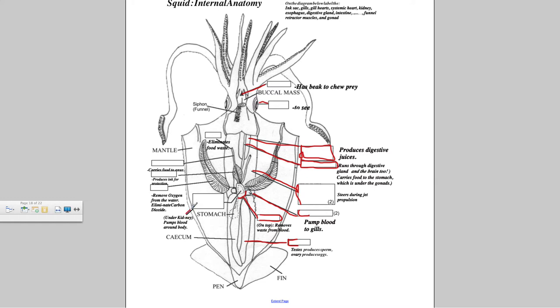Over to the left side, right near, underneath the kidney. This is another heart. They have all three. They need them all three. Just put heart. Then they could die.